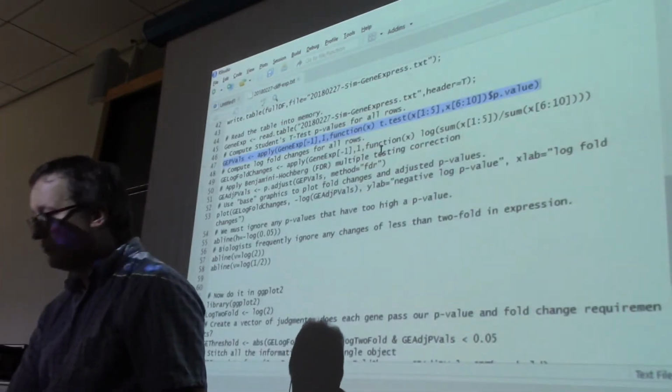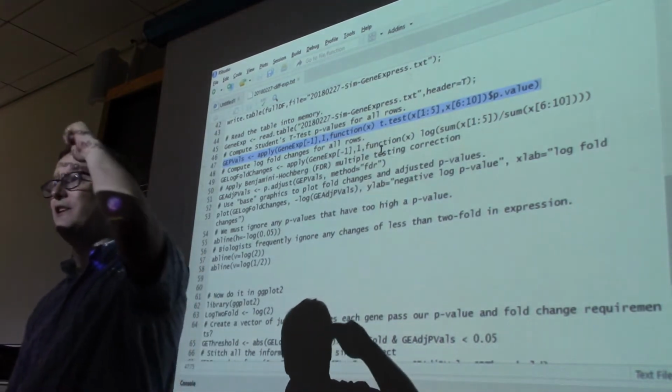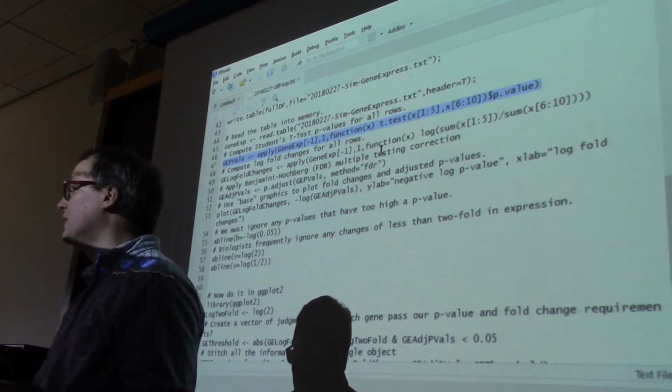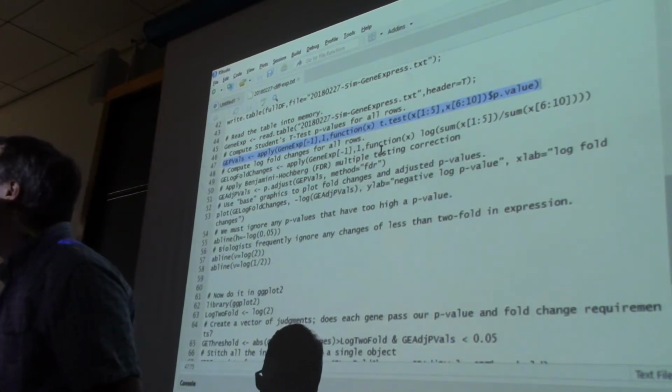Okay, so in brief, this one line of code is doing a whole pile of work for us. It's serially passing through all of those rows of gene expression values and performing 1,000 t-tests for us. So what do you think? Is that a 5-minute exercise, or a 30-second exercise, or is it as fast as an eye blink?